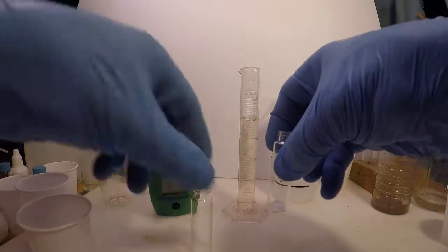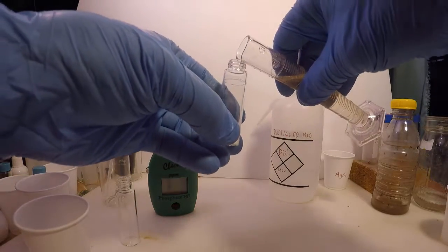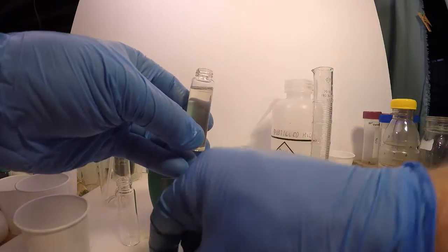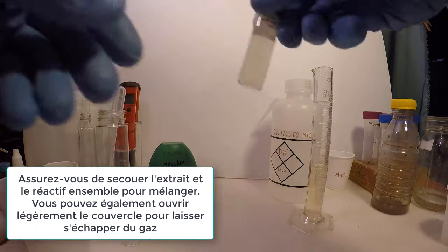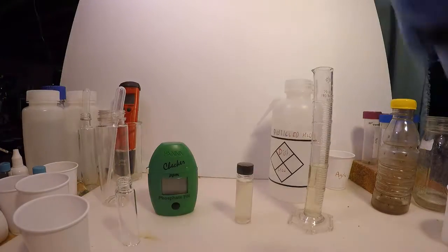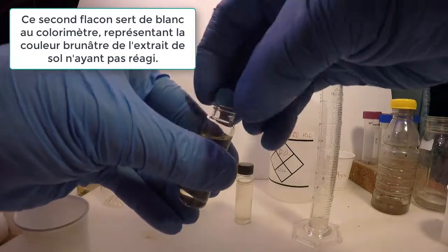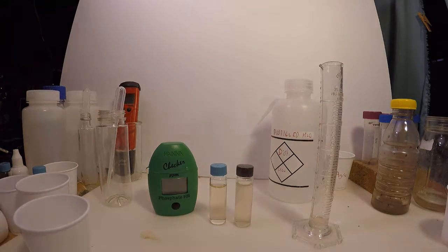Now it is time for the final step of mixing the neutralized extract with the phosphorus reagent that you have added to the vial already. Note that a second vial without any reagent is also poured, and this is used as a blank for the colorimeter to control for the slight tan color that the soil produces when it is extracted with Olsen solution.